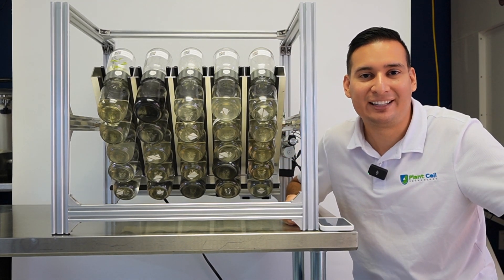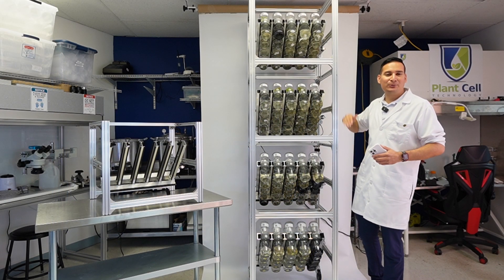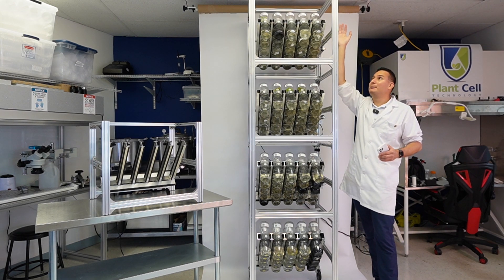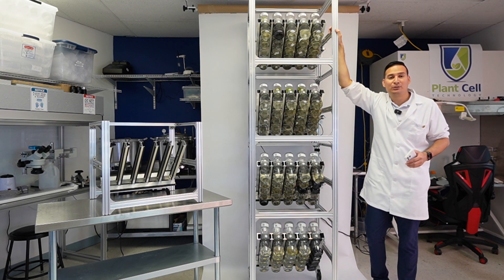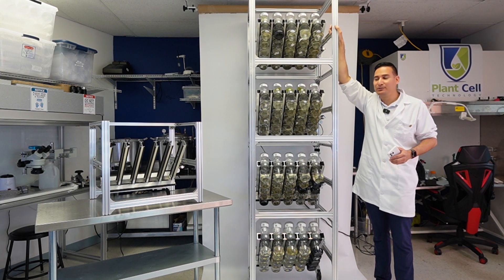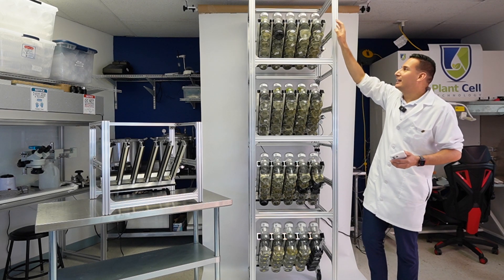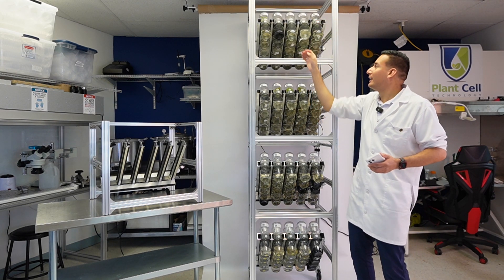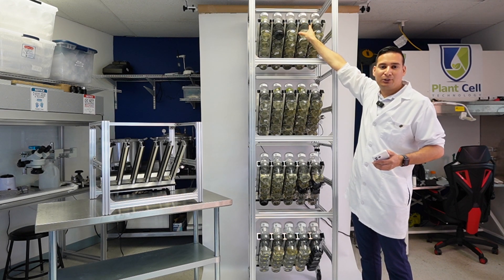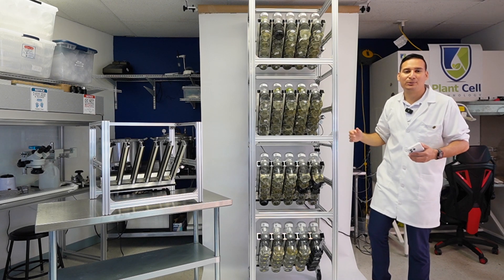One of my favorite features is that it is stackable — this is my favorite feature about the BioTill. It is fully stackable; you can go as high as you want. The ceiling is your limit. Here in the lab we have four units stacked on top of each other. I'm a very tall person and I can just reach the top biocouplers, but a shorter person might need a step stool.